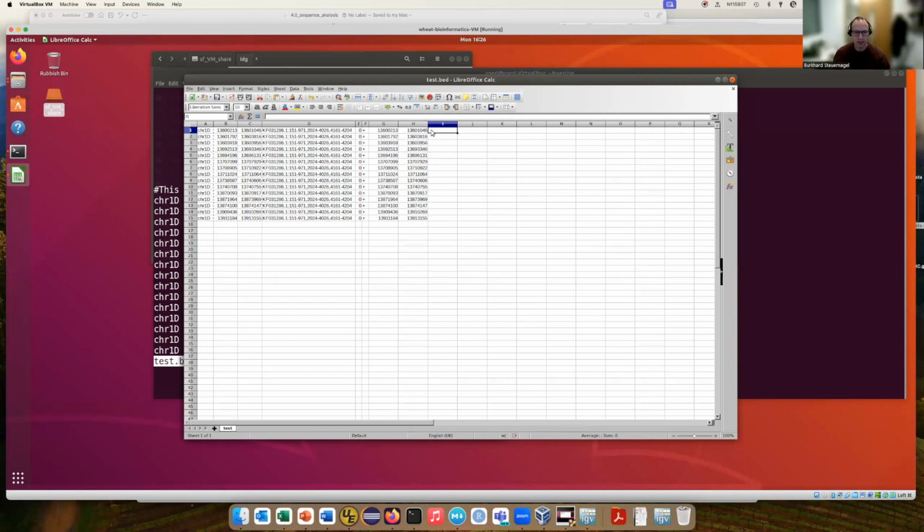So we take it very easily. If we have R on 255, and then comma, G, green on 0 and blue on 0, that should be a red entry then. And we can do the same game somewhere else. So let's say all of these first ones, we just have them in red. And then maybe some of these we have in green: 0, 255, 0.